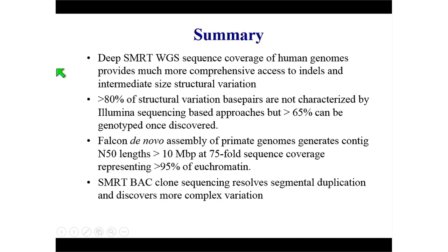So perhaps the final point that I'll make is that I think the technology here, and it doesn't have to be PacBio, but the idea of long-read uniform sequencing technology is the future of human genetics. As a field, we need to move away from aligning sequences to discover genetic variation, and we need to think about assembling a new genome to discover the full spectrum of genetic variation, because that's obviously what patients and what basic researchers require.